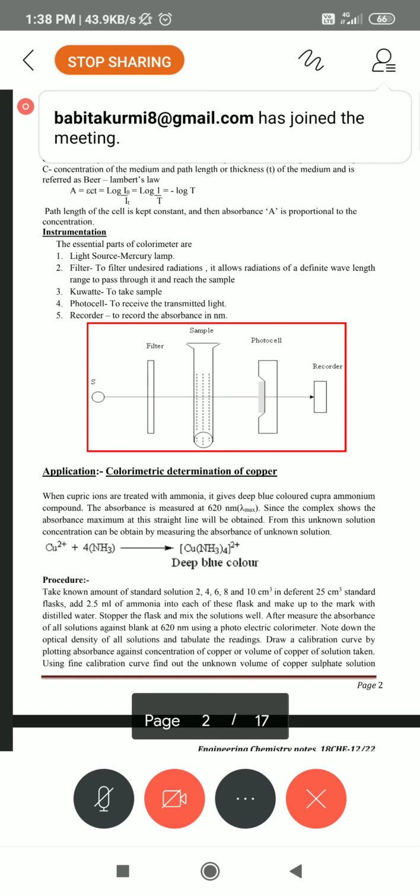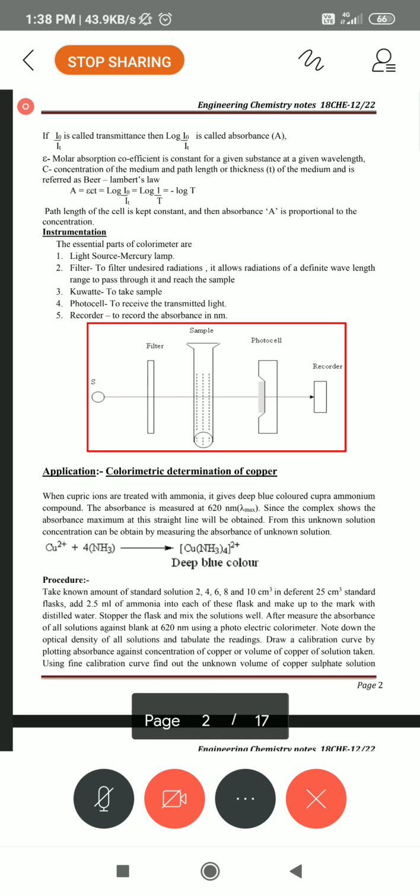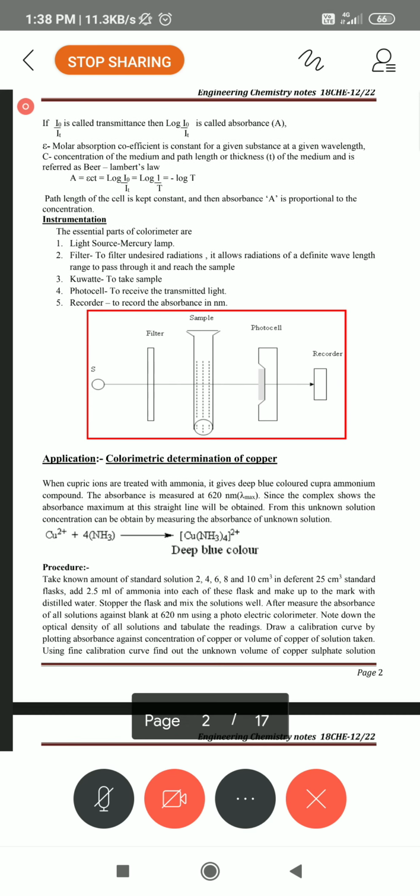Now we can label the instrument as a colorimeter. Color spelled COLYUR or COLOR, no problem. The calorimeter we used in module 3 was for the estimation of potential, heat energy or other forms of energy. Here we use it for quantitative estimation of how much salt is dissolved.